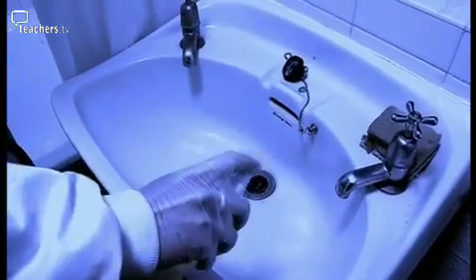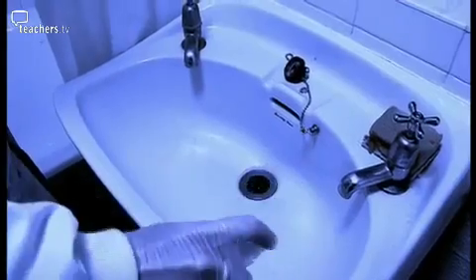Luminol reacts in a really similar way to Kastle-Meyer. The difference really is that instead of a colour change that you see in the reaction, you actually get a release of light. So these two chemicals react together and it produces a blue glow, so light's released, and it's a process called chemiluminescence. This chemical reaction can only be seen in the dark. So all sources of light have to be sealed off. Ordinarily, when two chemicals react together, they produce heat, but in this specific reaction, they produce light.